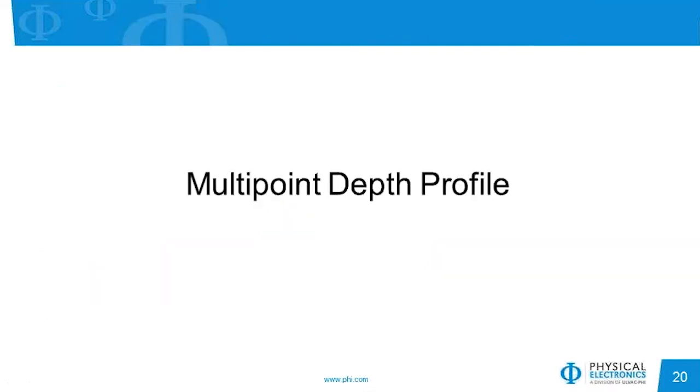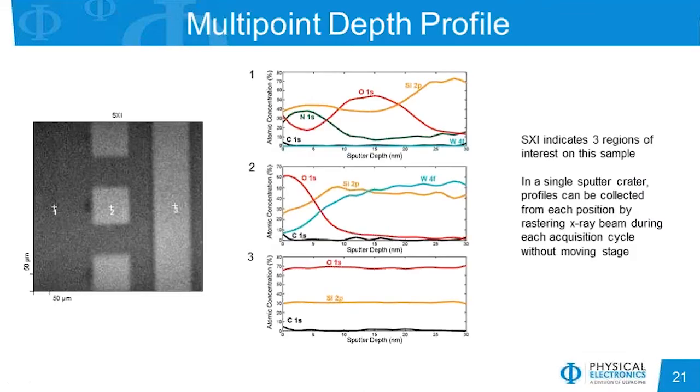Next, we will see how we can apply SXI to our depth profiling and mapping. One of the advantages of the scanning X-ray beam is that we do not have to move the stage whenever we want to do a multi-point analysis within the SXI field of view.